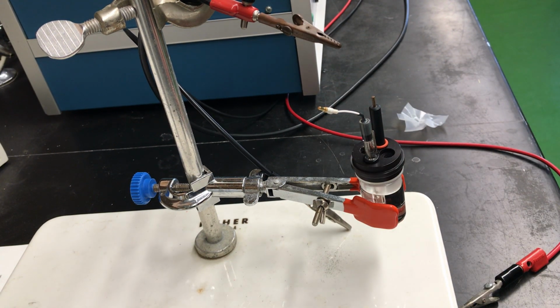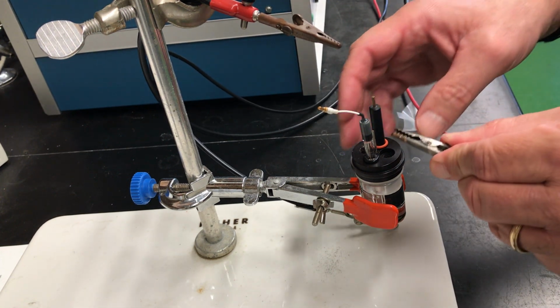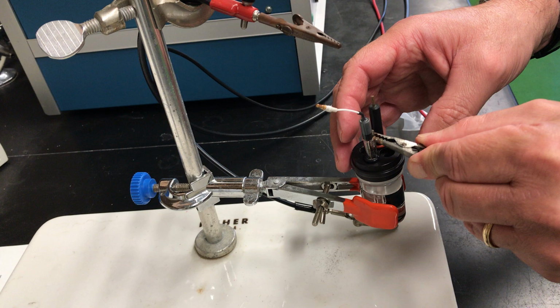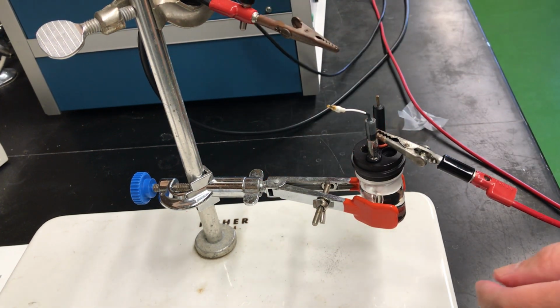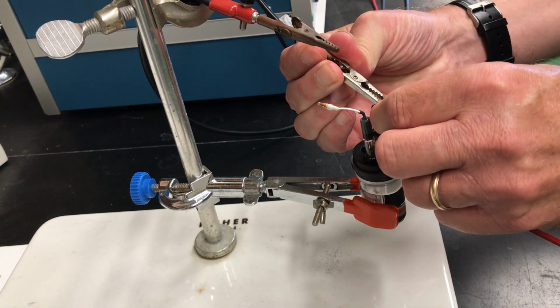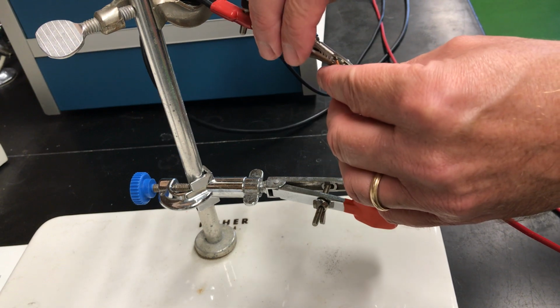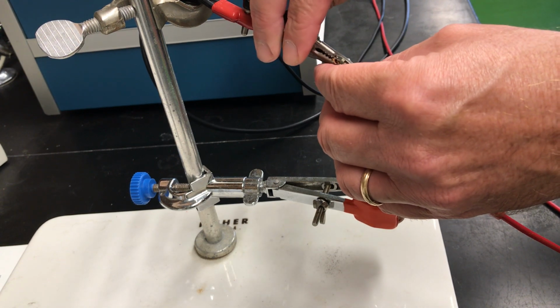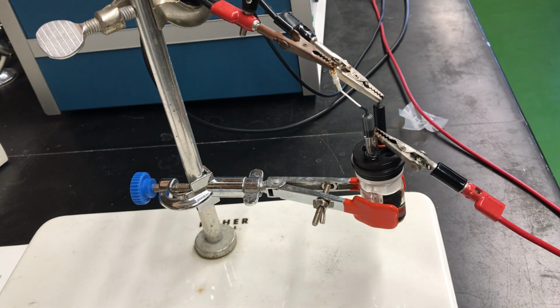Okay, now at this point, I'm going to remake my connections. Again, the red is the counter electrode, so it goes to the platinum wire. The black is the working electrode, so it's going to come into the carbon disc. And then finally, we're going to make our reference connection here to the reference electrode. All right, so now the acetaminophen solution is ready to examine.